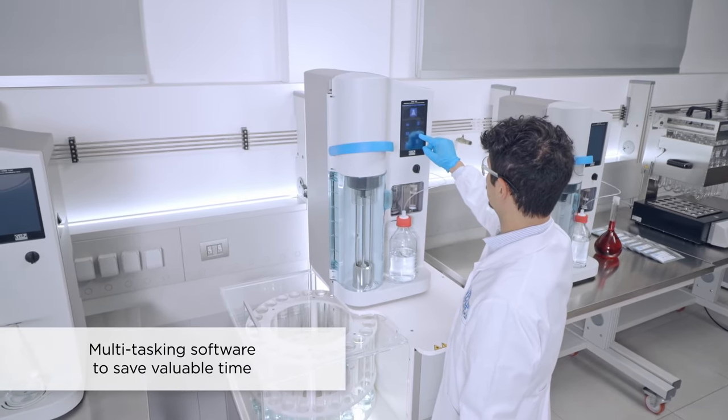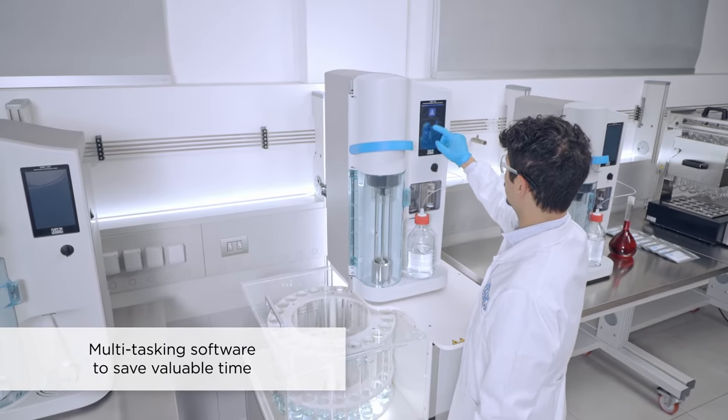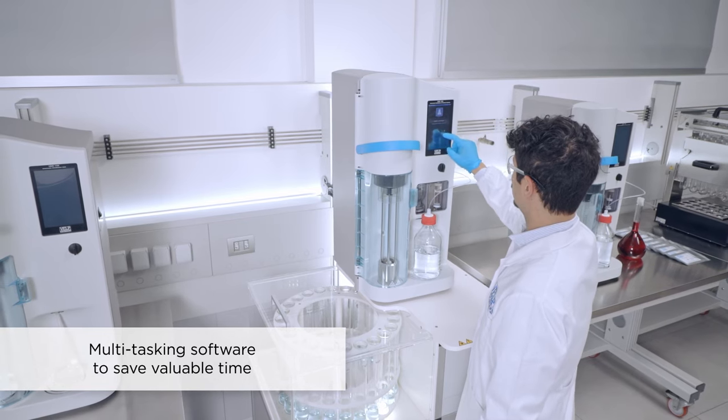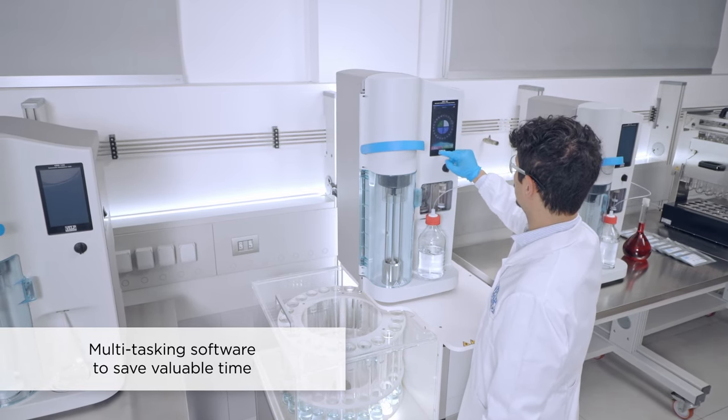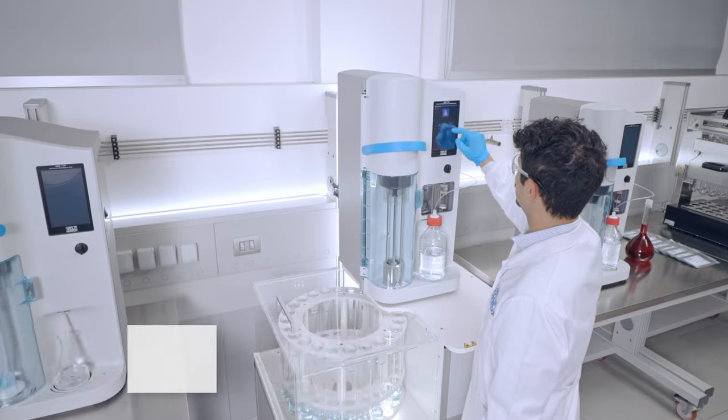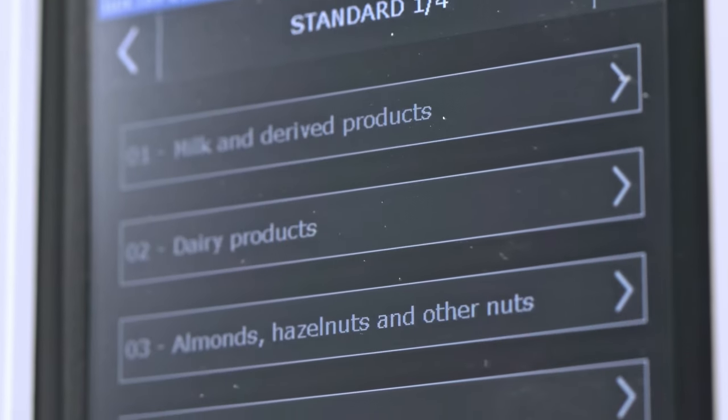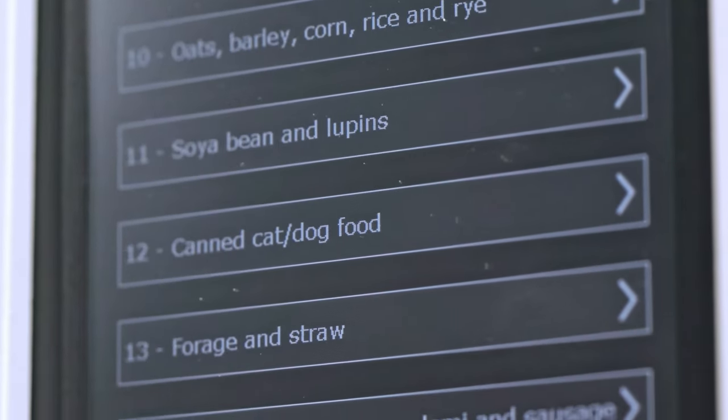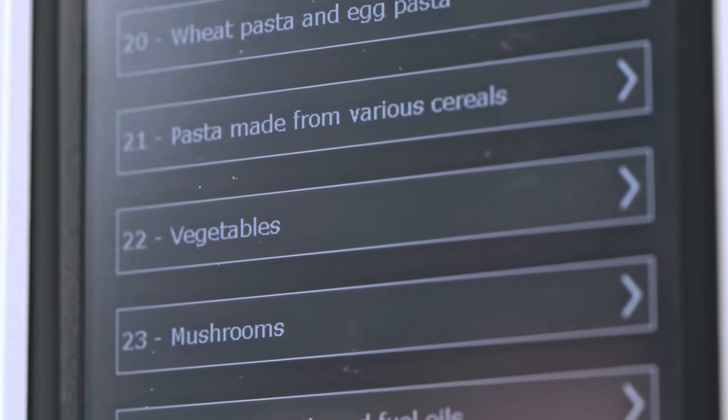The multitasking software provides full control of the distillation unit and the AutoSampler to set up a series of analyses saving valuable time. Choose from the rich library of pre-installed methods or create a new one following the guided procedure.